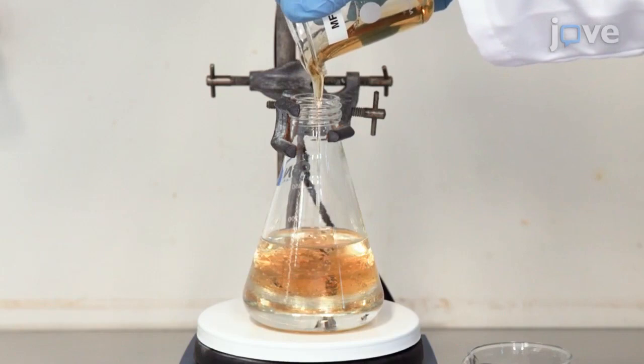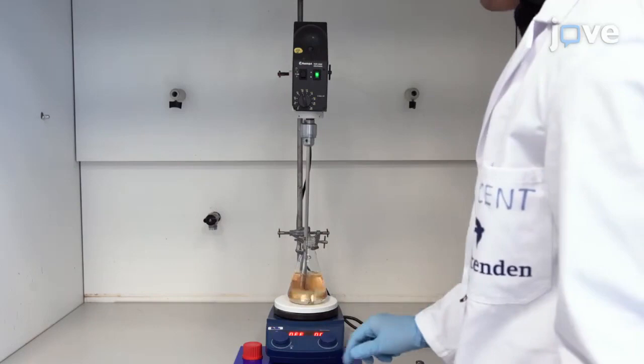Now stir the mixture at 200 rpm for 30 minutes at 50 degrees Celsius to ensure a homogeneous resin.